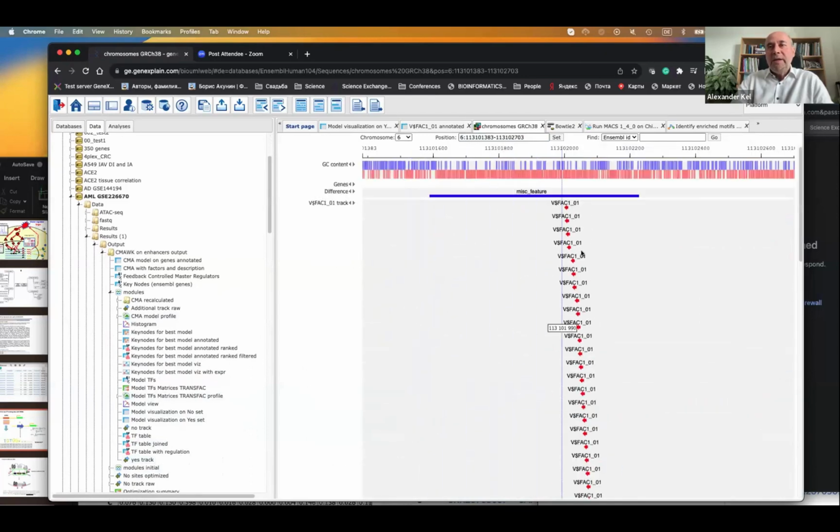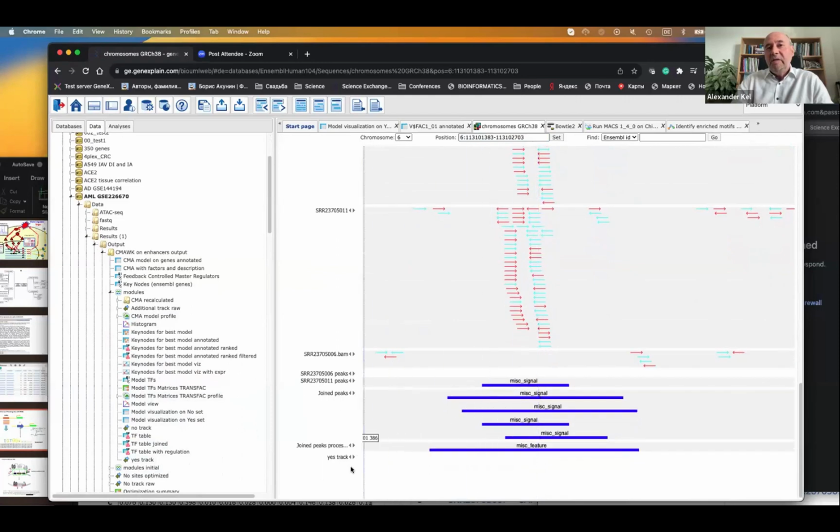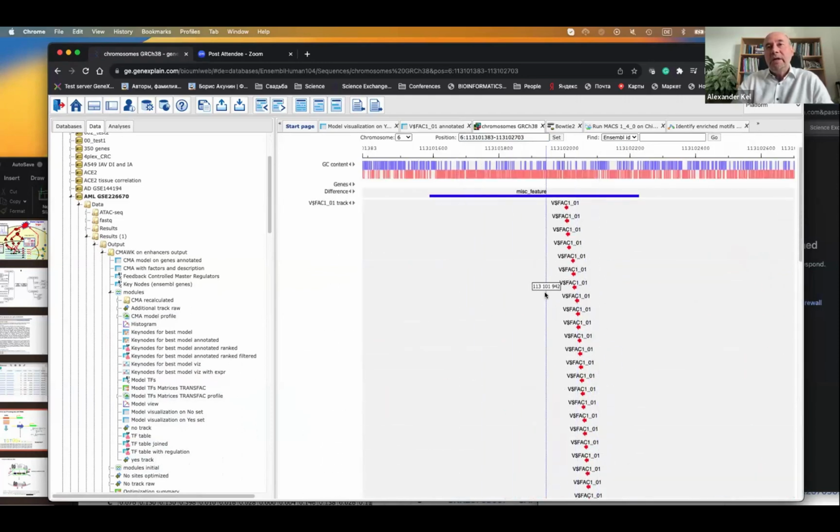Actually, this one track which we are looking at here was not near any gene which is upregulated, right? So although it's a very important track, an important peak, where a lot of these factors are binding and its chromatin is open, this area is probably not involved in regulation of genes. It's just a trap for many factors.